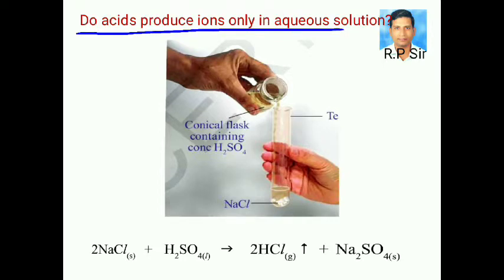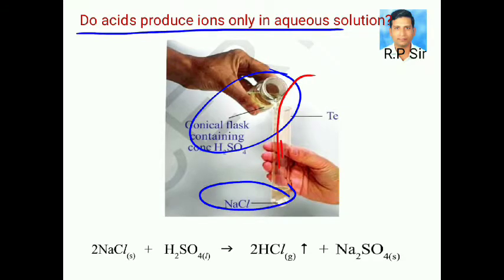Take about 1 gram of solid NaCl in a clean and dry test tube. Add some concentrated sulfuric acid to the test tube. You observe there is a gas coming out of the test tube.